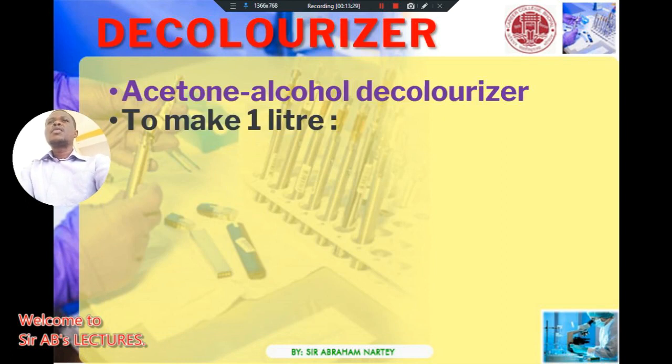The next one, we want to prepare the decolorizer. As a lab technician, I'm teaching you that you should know how to prepare all these things: the decolorizer, the primary stain, the mordant, the counter stain. At the end of this lesson, you should know how to prepare all of them. So we are now on the decolorizer, that is the acetone alcohol decolorizer. Our aim is to prepare 1 liter.